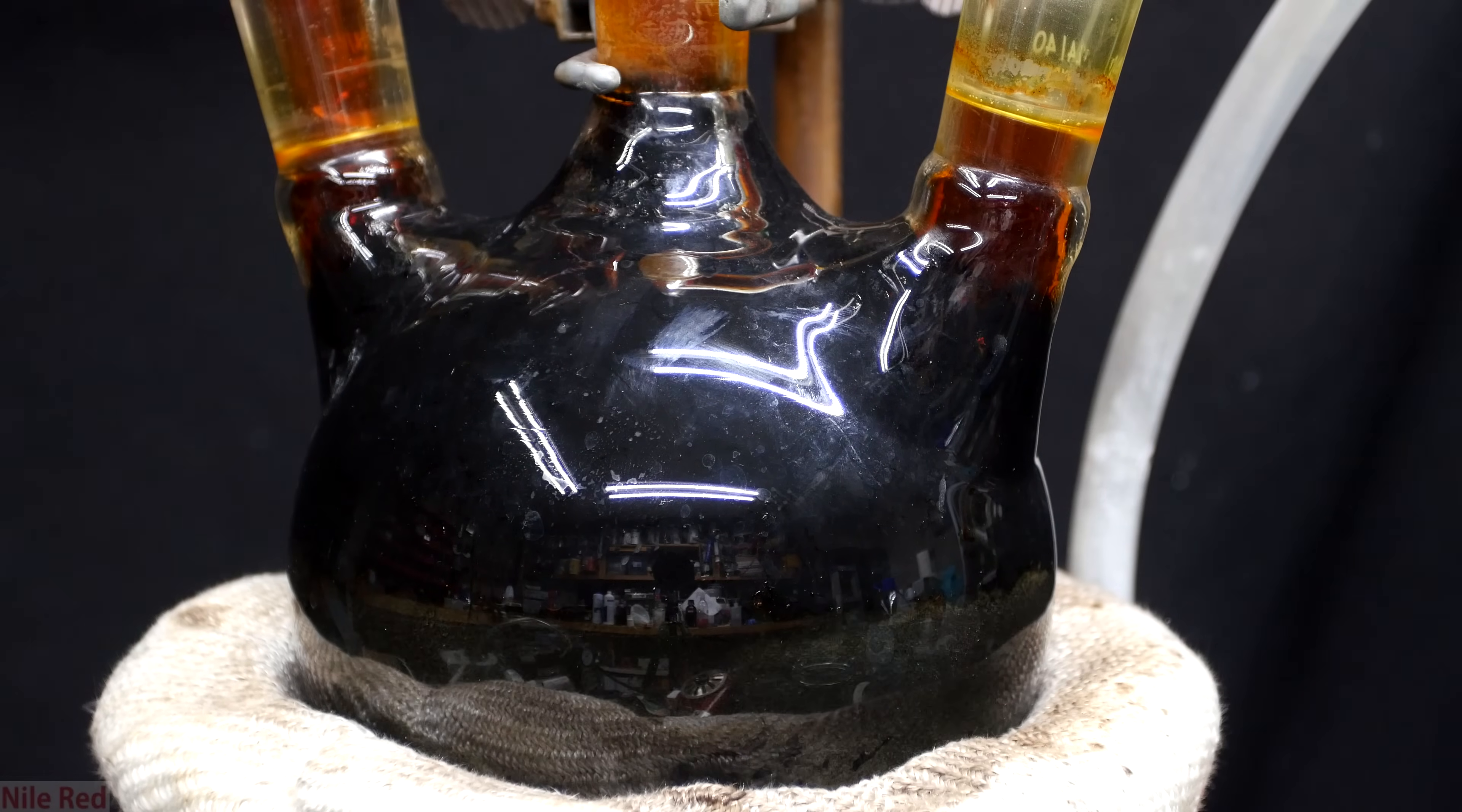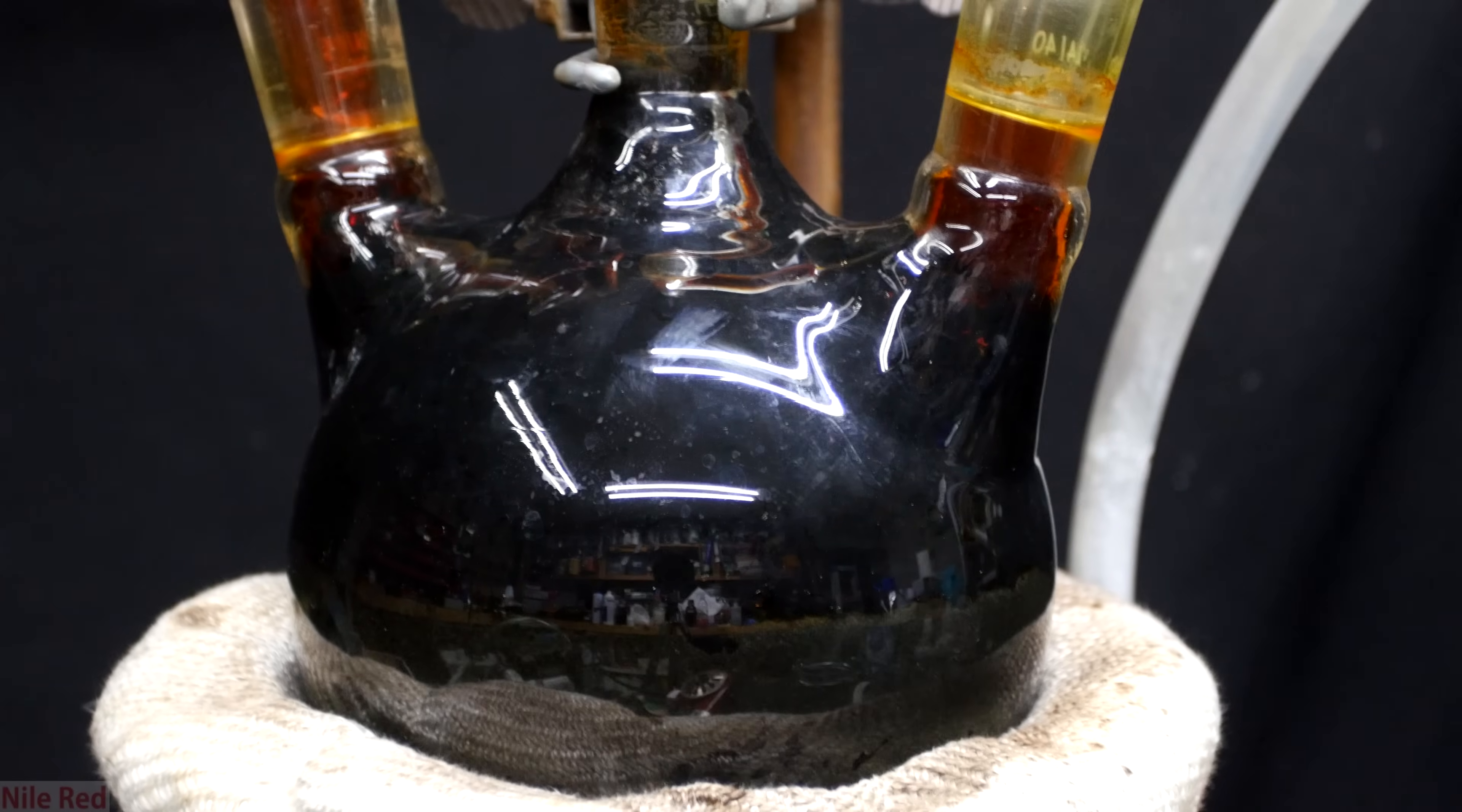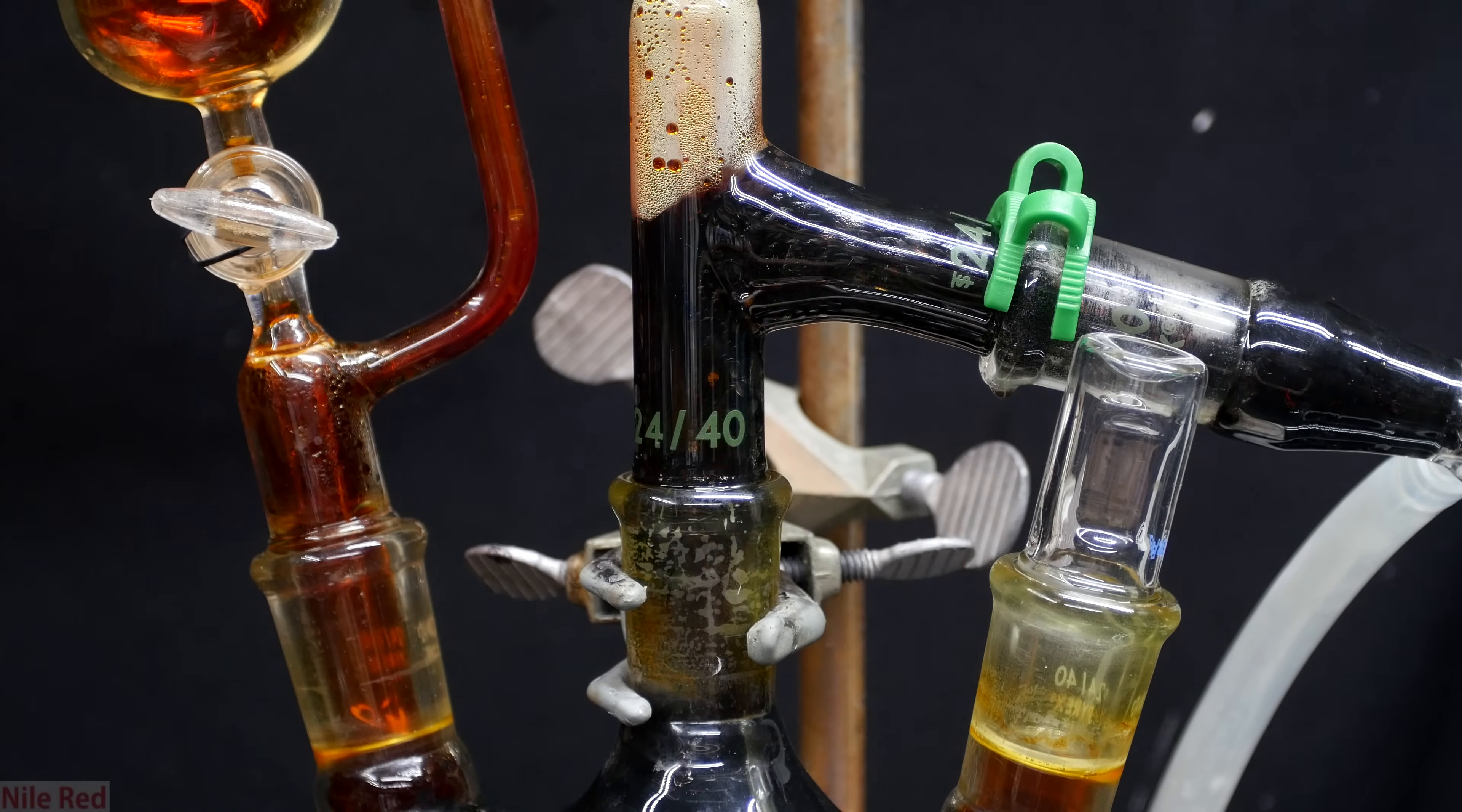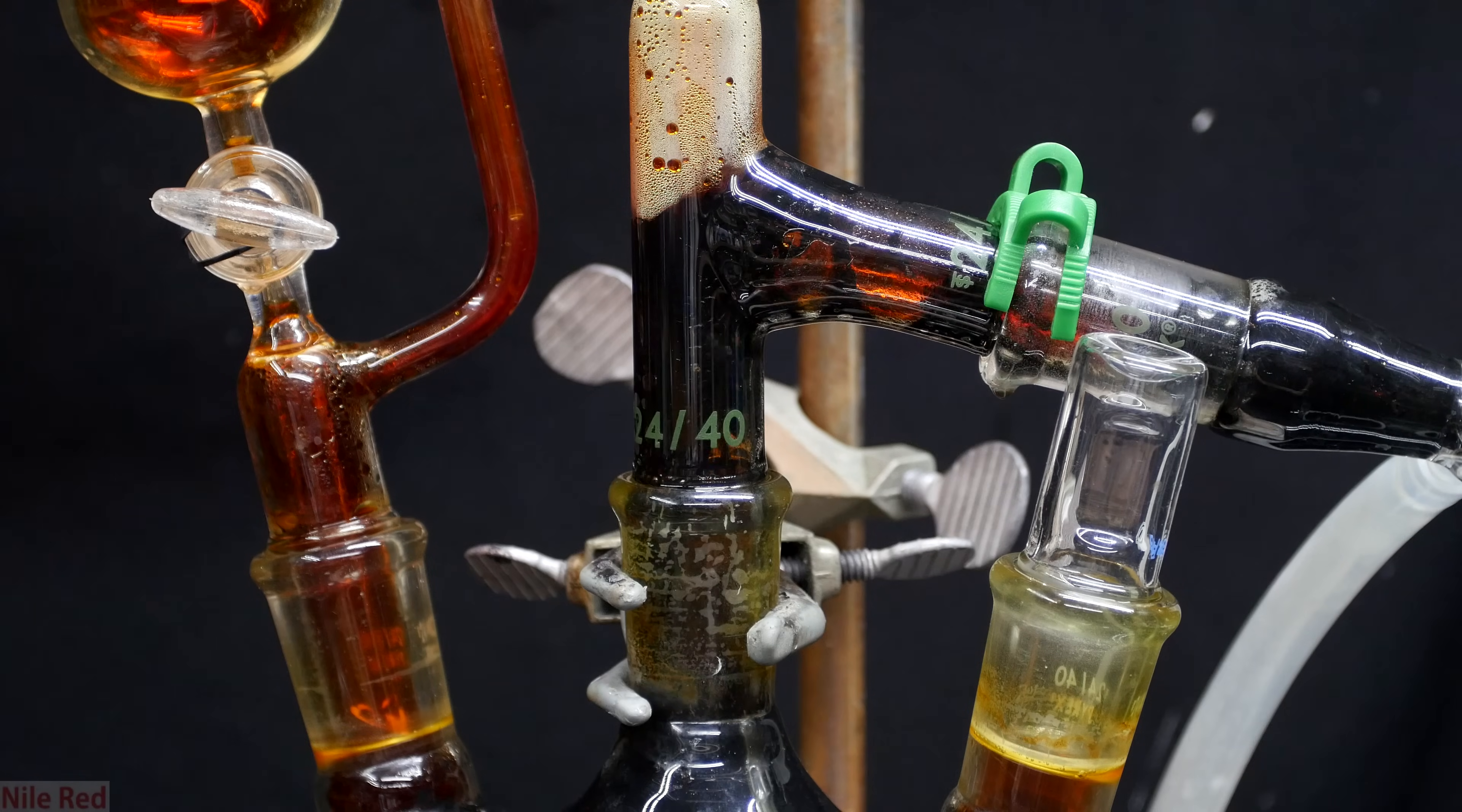The reaction is done when the contents of the flask start to froth. You can see here that the flask is now black and it's climbing up into the distillation apparatus. Because of this, some of the contents was able to froth over and make it into the receiving flask. This is really undesirable, but it's not the end of the world and it can be fixed with an extra cleaning step.